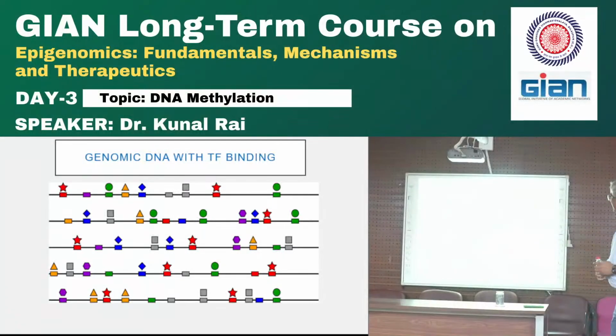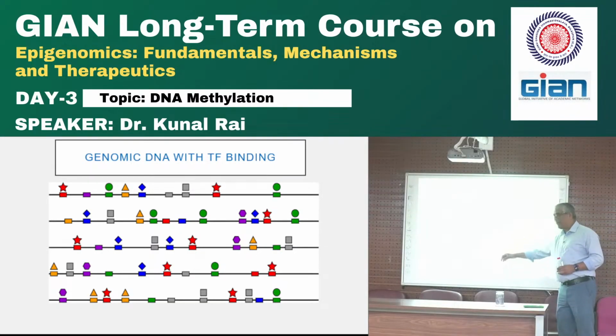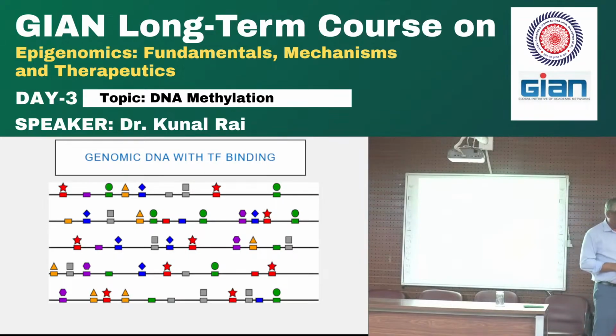Pull down stuff. So you got your red stuff, which is what you're looking for. You got stuff that actually just came because it wanted to, right? And some of this other stuff came because the antibody was pulling stuff down that was not supposed to be pulled down. Then you clean it up, the proteinase can digest it.